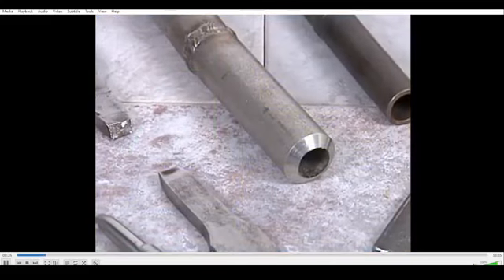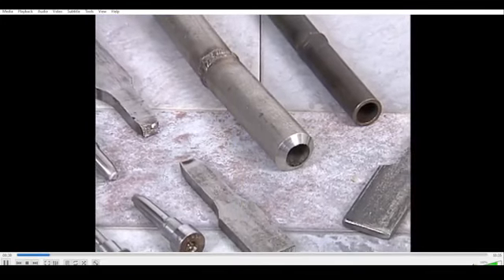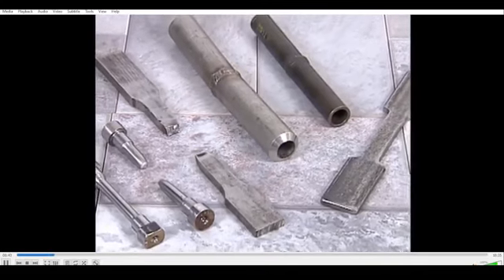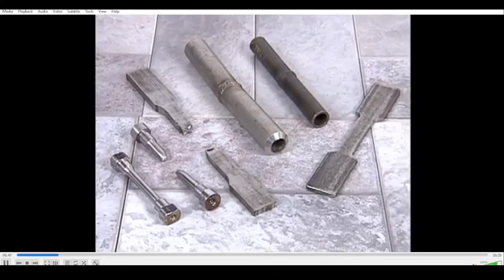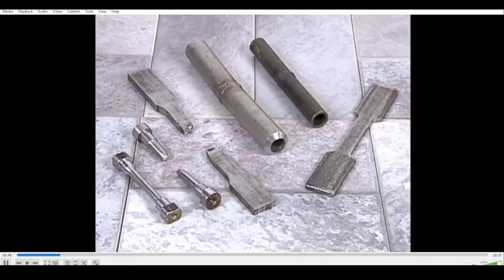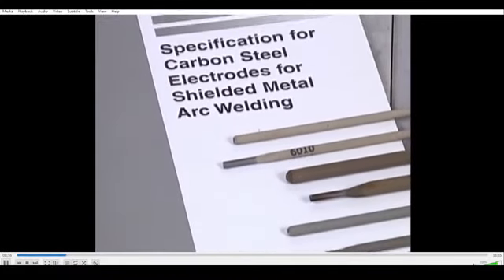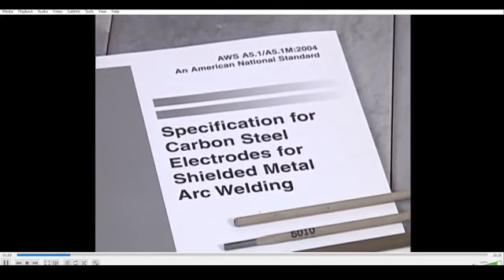There are a variety of tensile tests, differing primarily in the specimen's shape and location of removal. All weld metal and all base metal specimens are used to determine the strength and ductility properties of each. These tests are commonly used to classify base and weld metals to national standards. For instance, filler metals must meet minimum mechanical properties as specified by the American Welding Society's Filler Metal Classification System.